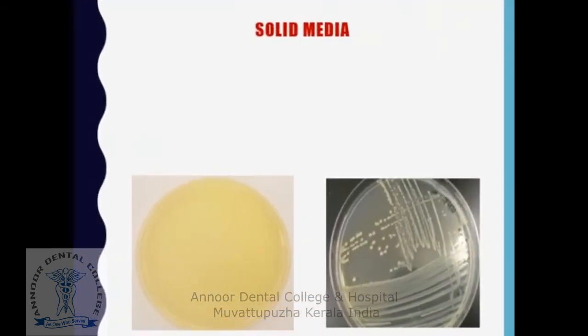We'll start with solid culture media. It is used to study colony morphology of bacteria. Colony means a clone of cells originating from a single parent cell.